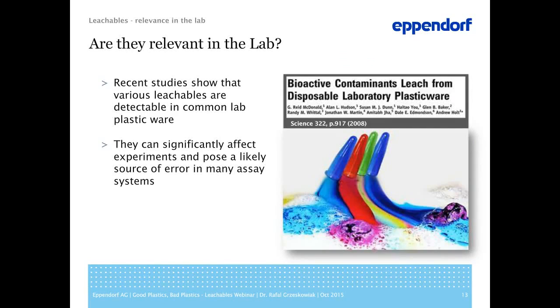Let's move on. So, how about the lab? How about leachables in the lab? Are they relevant in the laboratory? And the answer is yes, very much.